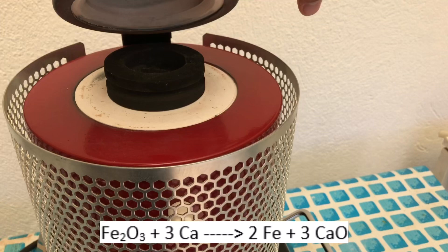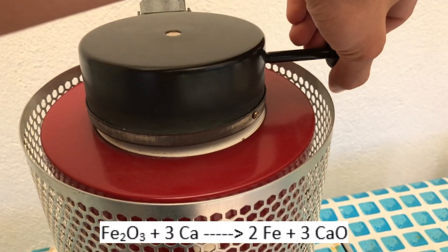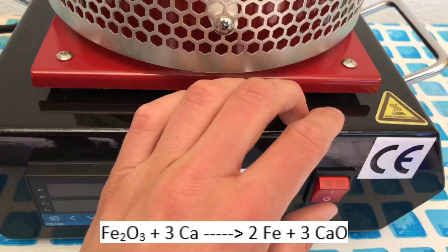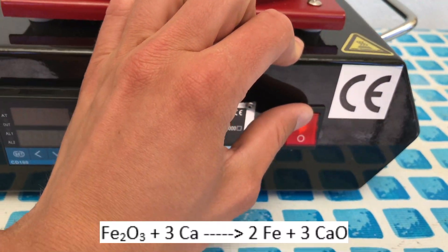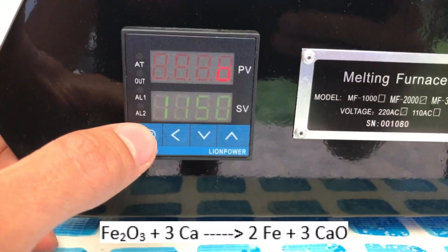The reaction which is taking place will be similar to the one shown here. Iron oxide reacts with calcium, which is the less noble metal, to form elemental iron and calcium oxide. We however are not using iron oxide because iron as a product, well, it would be boring.